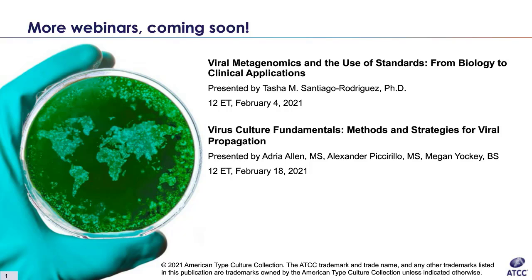You can get the absorbance to correspond to a more detailed number of cells. So it's a bit more sensitive as far as getting a more accurate cell number, and it's a little bit quicker. So that's sort of an advantage to the XTT. But they do pretty much the same thing, so both are certainly acceptable.